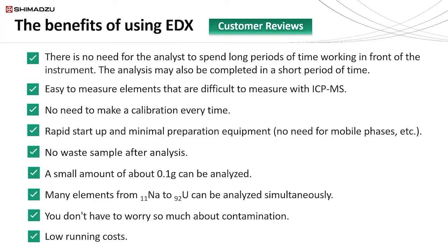So one of the benefits is that there is no need for the analyst to spend long periods of time working in front of the instrument. The analysis may be completed in a short period of time as well. Analysis can be anywhere between seconds to minutes to an hour, depending on the element, the detection limits that are necessary. But regardless of the analysis length, the analyst does not need to be in front of the instrument while it is measuring the sample.